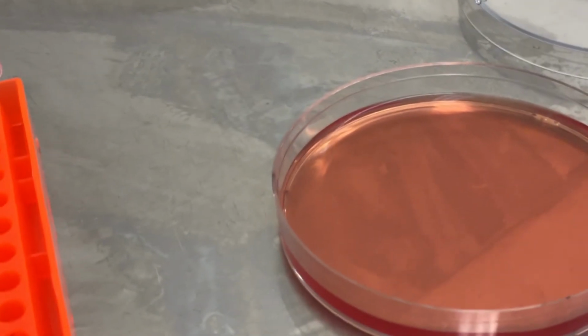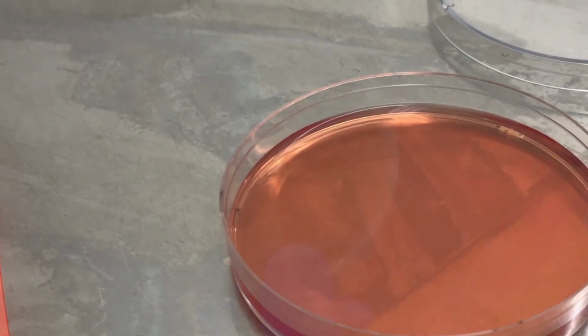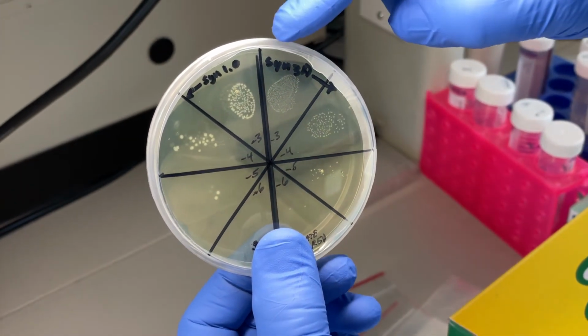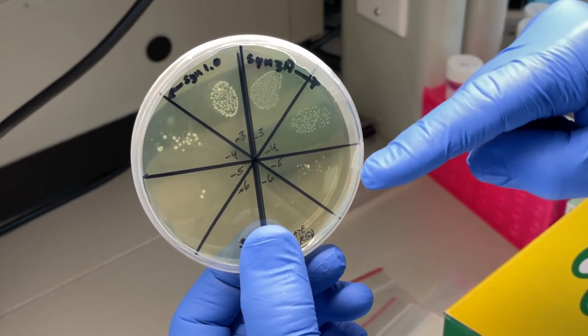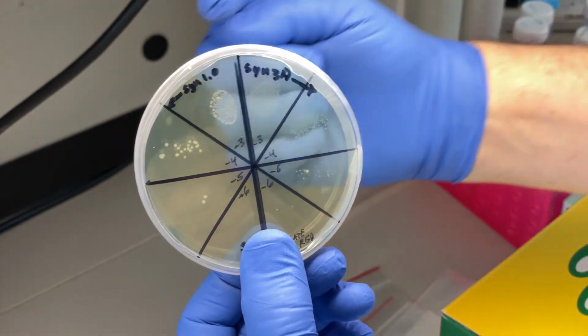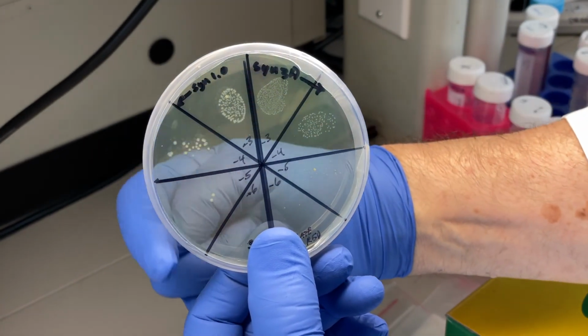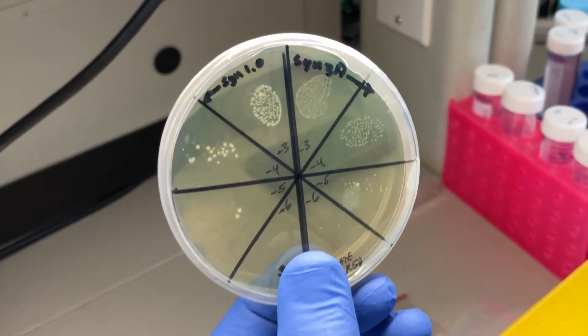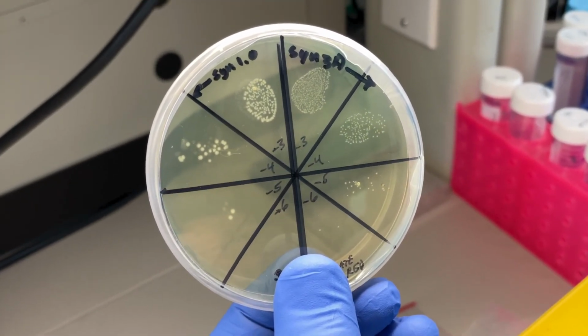The other thing to show is the result of the titration, where you have colonies formed from the different dilutions. In this case, 2 different organisms. You can see where at high dilutions you can achieve separated colonies where those can be actually picked and used, or the whole thing can be used for approximate titration in colony-forming units.